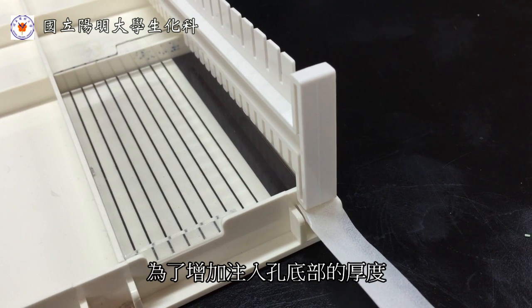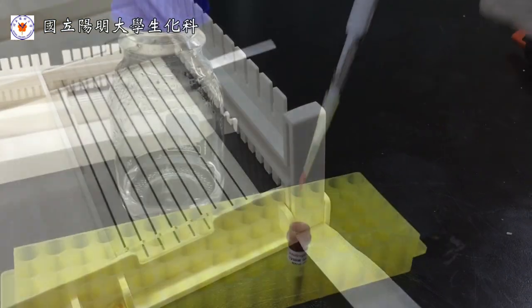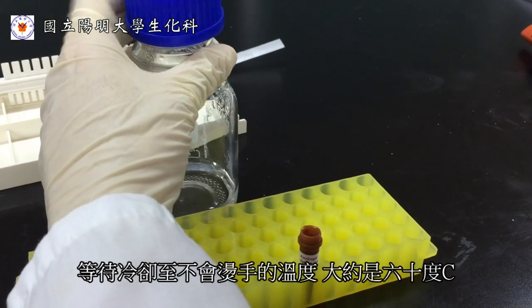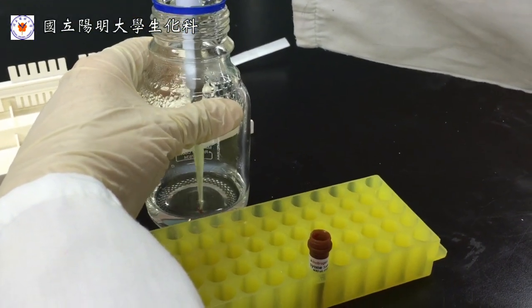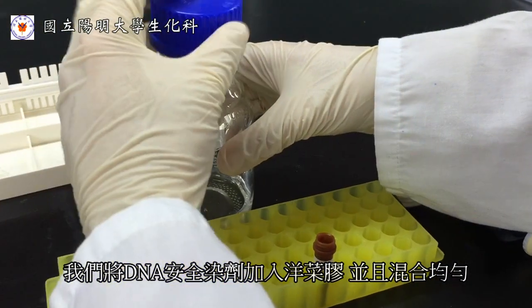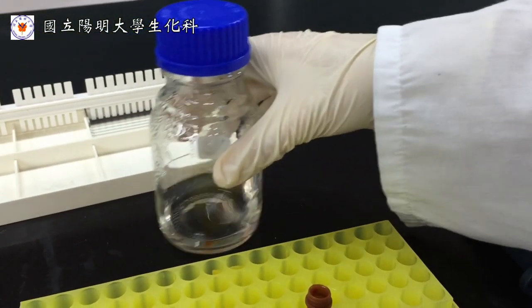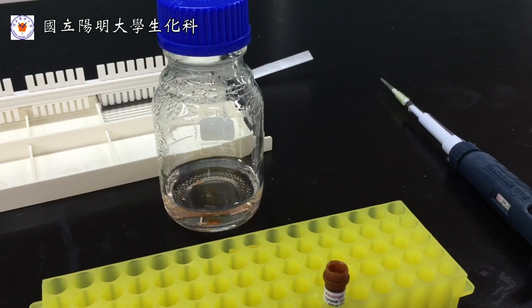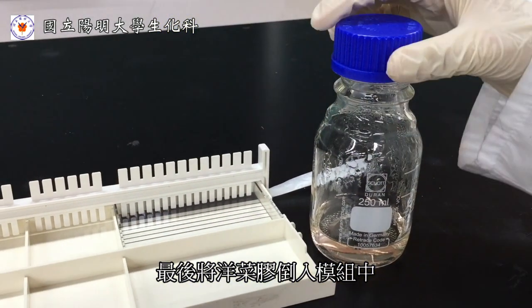To increase the thickness of the well bottom, we lay a tiny sheet of paper to heighten the sides. When the solution has cooled down to around 60 degrees Celsius, we pour DNA safe dye into the agarose solution and mix them well. Finally, the solution is poured into the module.